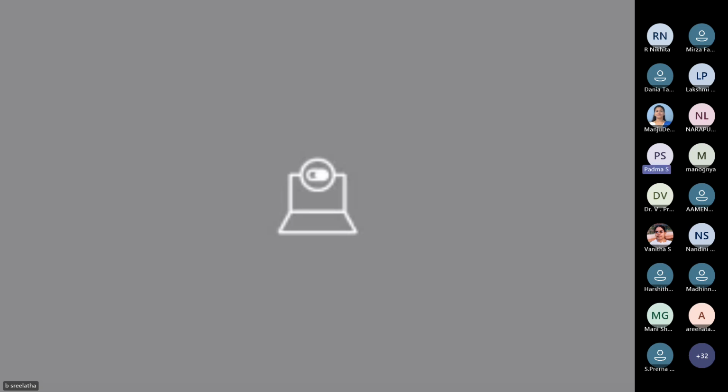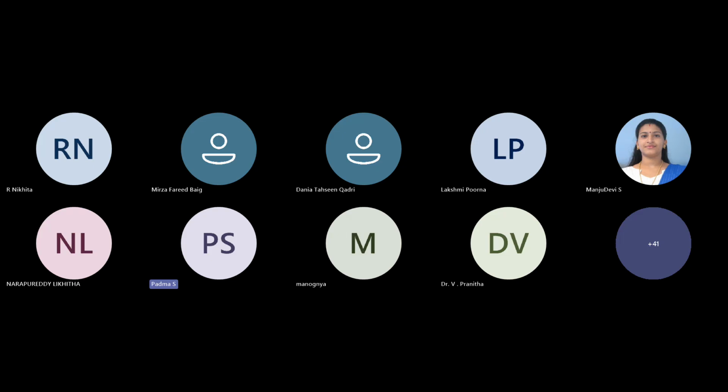Okay, so I'll go to this place which we are all familiar with. Now I will show you the basic simple program which all of us can use. All are simple to use. This is most user friendly. So what I have done is I have gone to the browser. I have selected Primer 3, and when we want to predict the primers or design the primers, we take the Primer 3 tools. There are several other tools. If you scroll down, you will find many other primer tools.